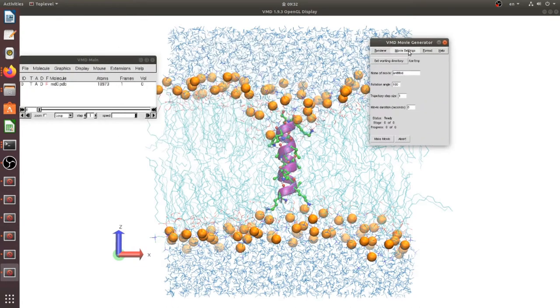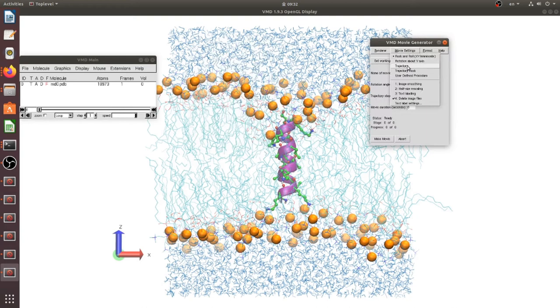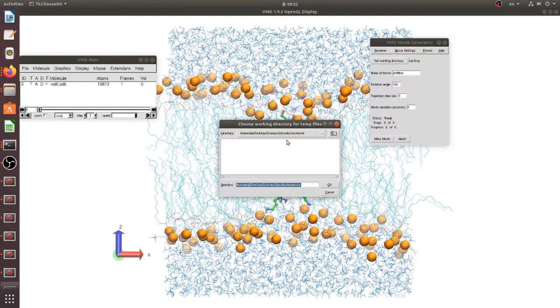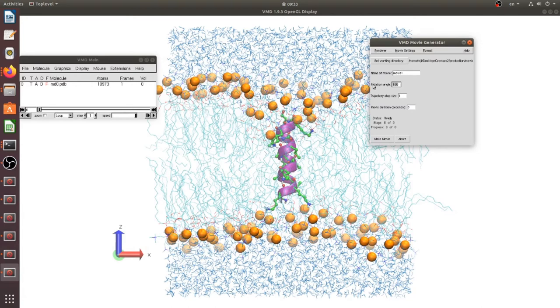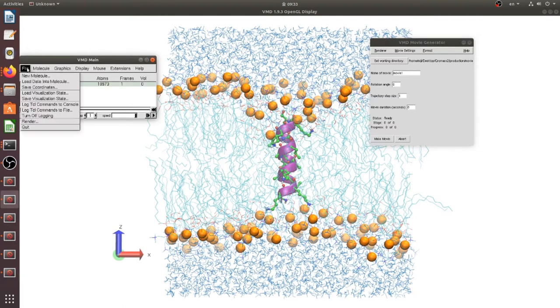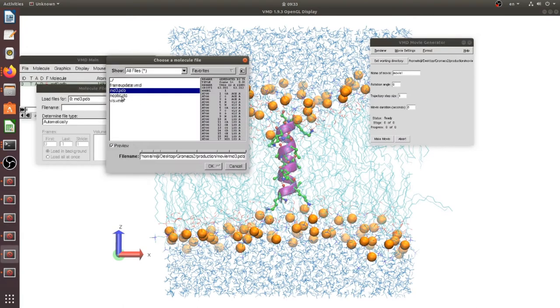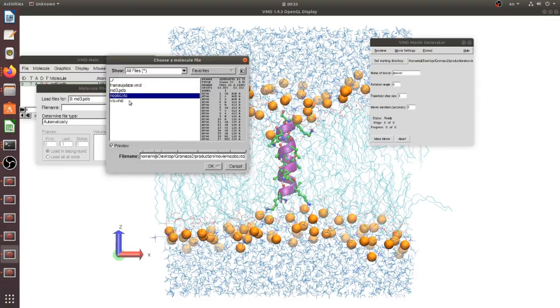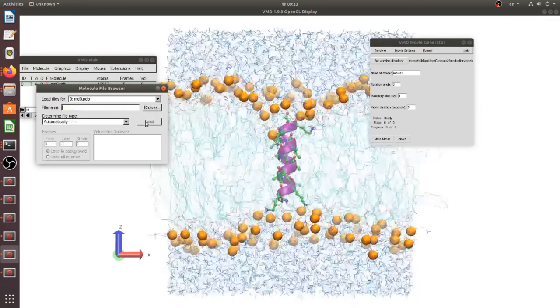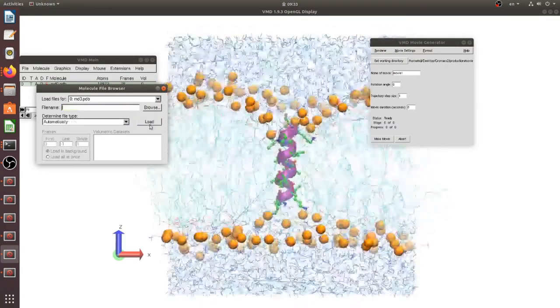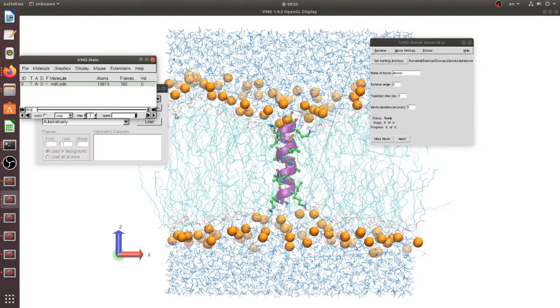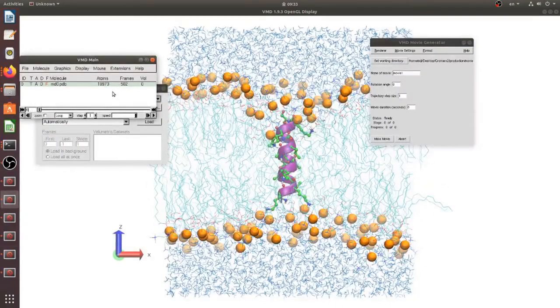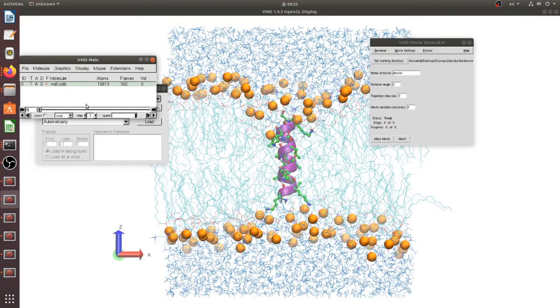And trajectory, now we should set working directory. Okay it was changed. Here is title movie one and rotation zero. Now we should load our trajectory and there is one snapshot.